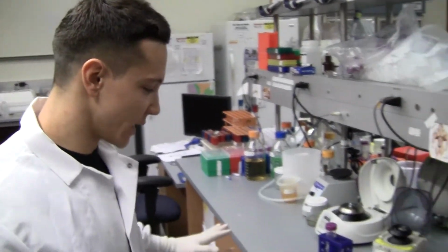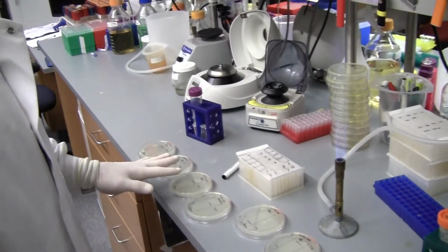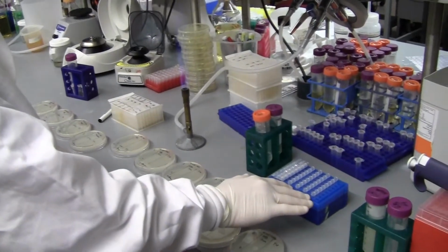So I've done a little bit of setup. I have a bunch of plates that I've already marked up. We'll go over what all these markings mean. I have a few PCR strips right here. We're going to be using these for serial dilutions later.